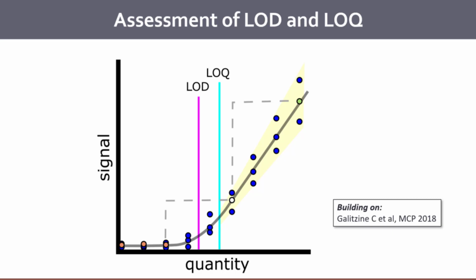So if you have these two measurements where the difference in intensity is in this linear range of the calibration curve, we would often say that those measurements are probably quantitative. If you have a measurement down here where one of the points is below the limit of detection or limit of quantitation, and the other point is above it, there will be a difference in the signal between them, but I wouldn't necessarily say it's quantitative, because the change in signal is not a linear response from the change in quantity. Does that make sense? So all calibration curves, whether it's a BCA assay, a UV or fluorescence assay, etc., all have the same sort of limit.